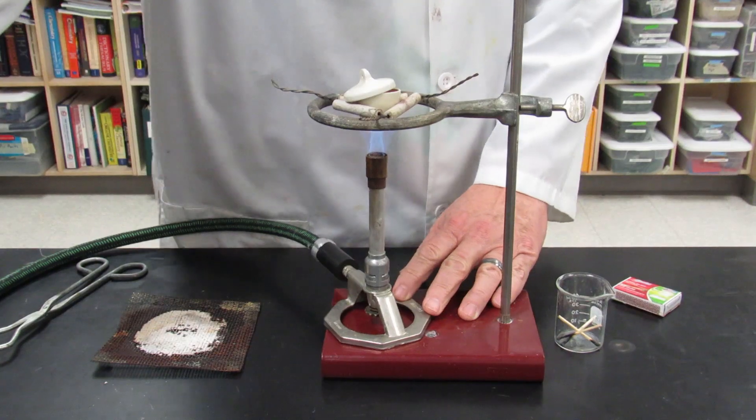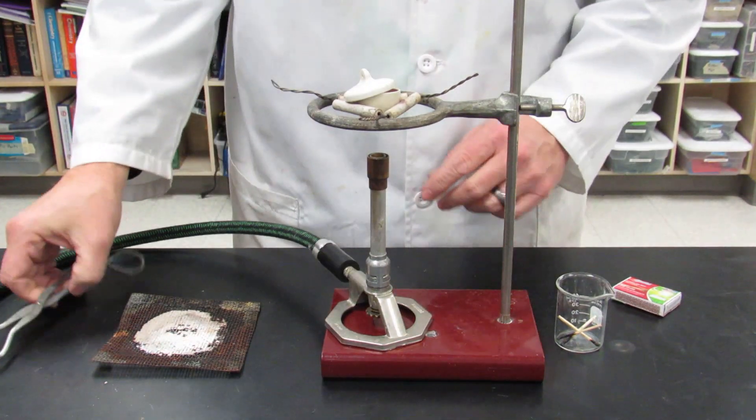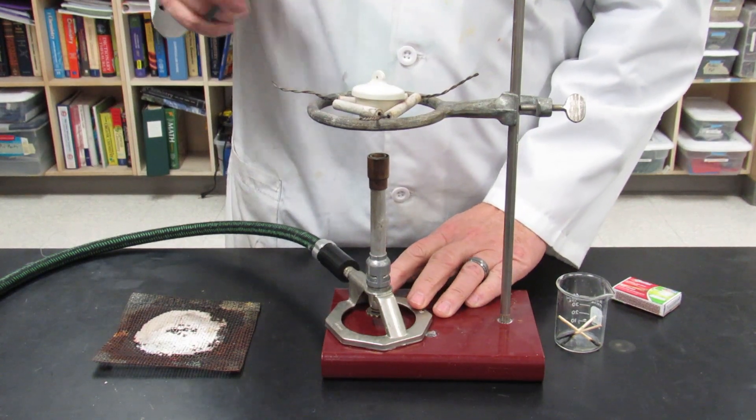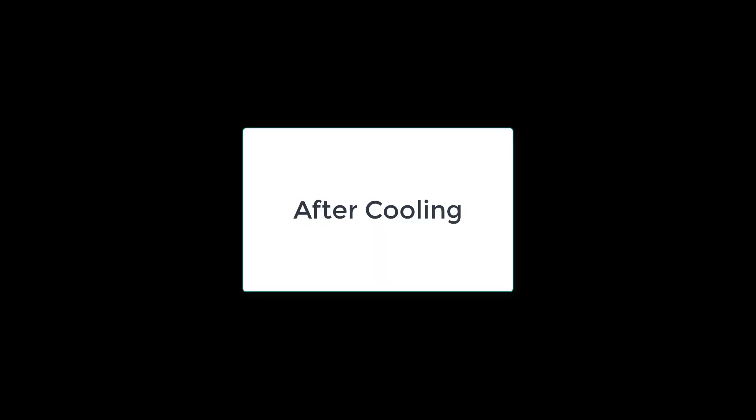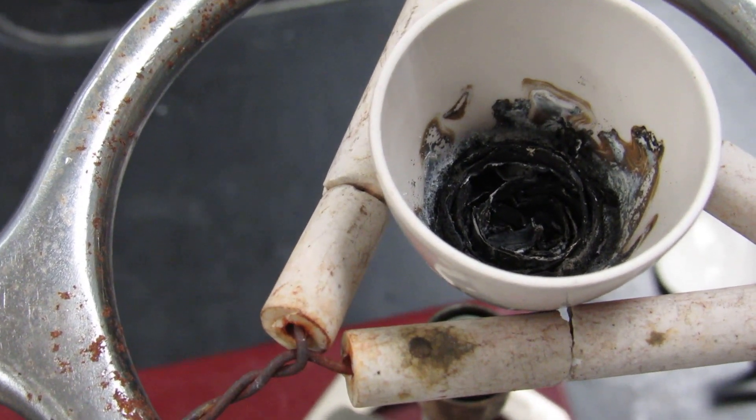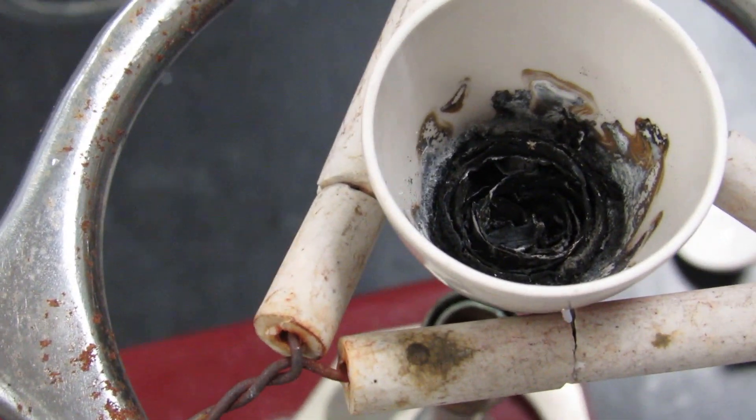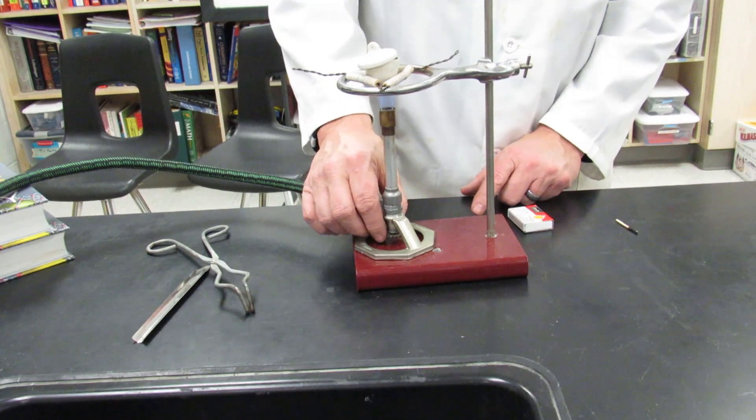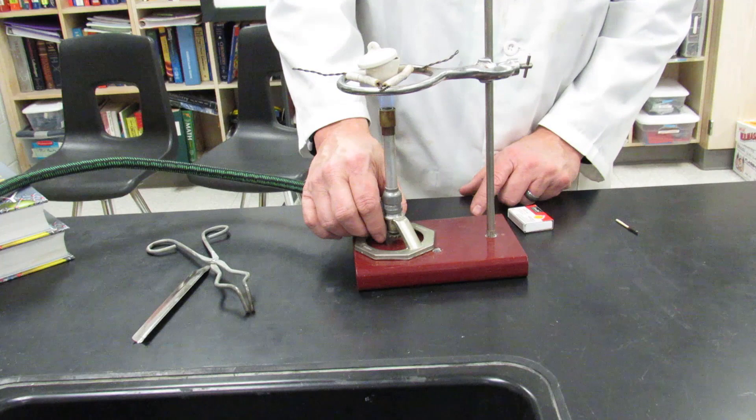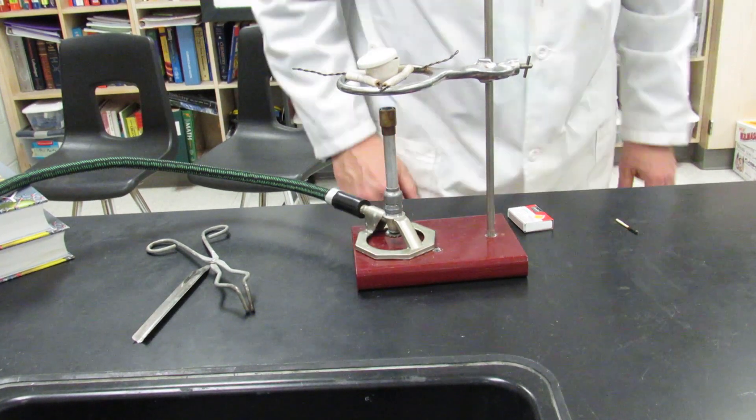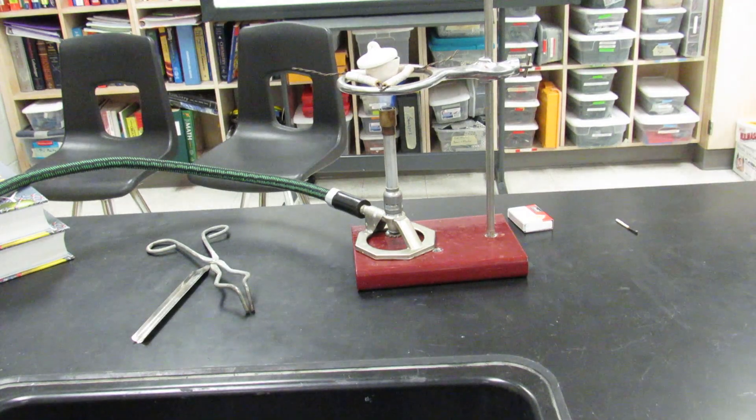Allow it to cool. And then you're going to see whether or not it's completely reacted. And you see this thing has a little bit of metal to it still. So, since it hasn't all reacted, put it on the hottest part of the flame again. You want to have zero metal. You want to be able to poke at it and have all the pieces be very brittle.